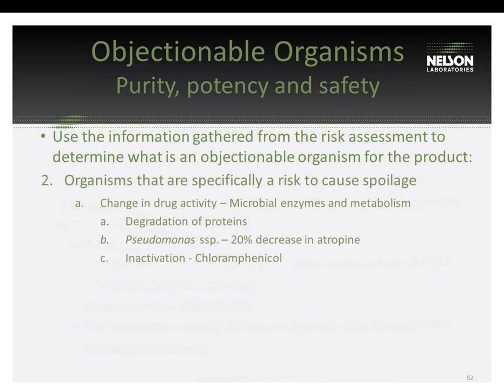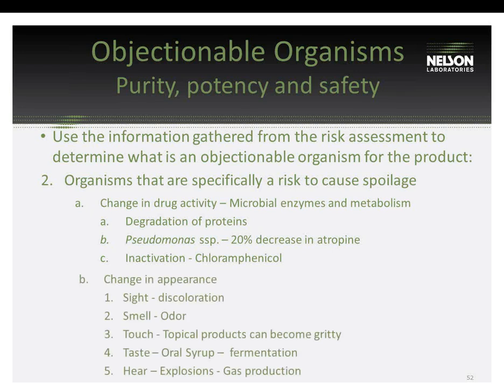Next, looking at the risk to cause spoilage. Is it possible to look at what type of organisms could possibly change your product? Are there activities that could degrade the proteins? It's found that Pseudomonas contamination can decrease the active drug with some drugs, or even some organisms can inactivate the preservatives in the product.